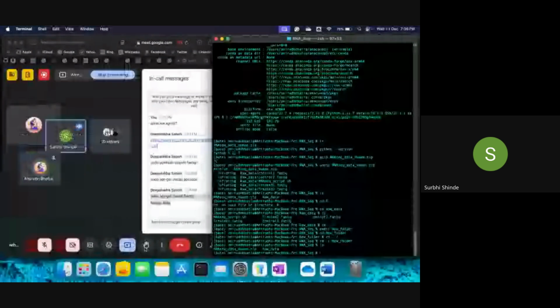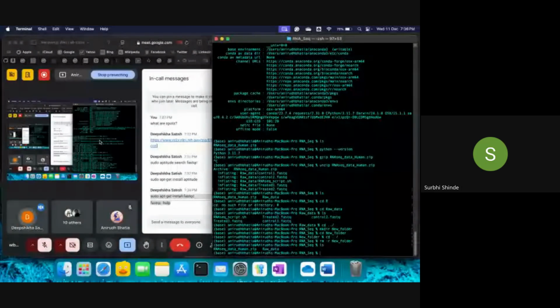Who was it? Surbi ma'am? I don't have that raw data downloaded. Okay, no problem. He's also having the Mac, you can see. So, did you download that Anaconda script which I have shared?